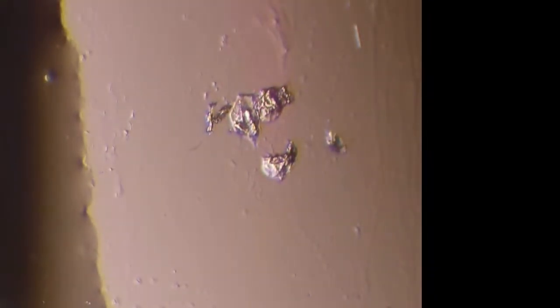There are techniques for adding water to a slide so it doesn't evaporate, but they're kind of hit or miss because of capillary action with the cover slip. I've tried many times, and sometimes you totally wash away what you're looking at, and then it's hard to find it again, and you end up having to move the slide away anyway. Or it just collects on the top more than between the pieces of glass because of the capillary action. It's squeezed so much there's not a lot of space for the water to go in there. So, almost like a suction.